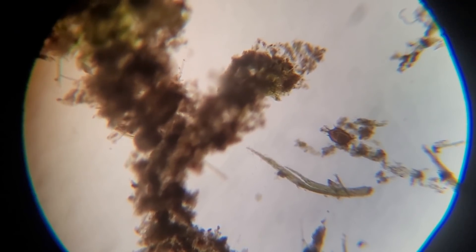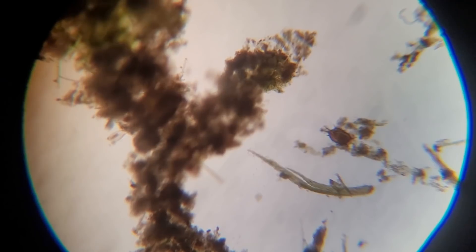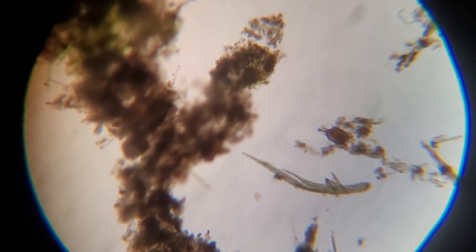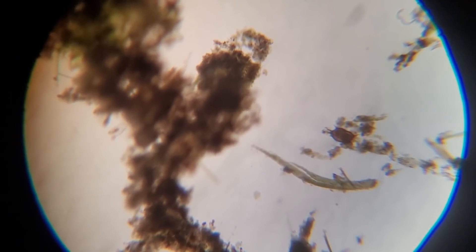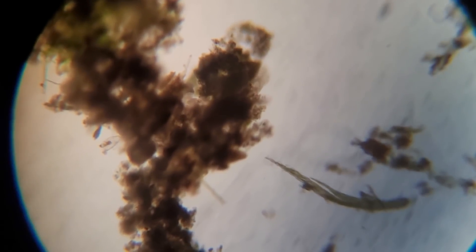Here's a good clump of material in this eyedropper — let's hold it still and see what life is present. It looks like we have one paramecium. We also have colonies of algae forming. There may be another little critter in there — like an amoeba, though it may be dead. And something is moving around that mass and eating it: maybe a stentor, maybe a tardigrade, or a little worm of some sort. So we do have some basic life, but mostly algae. It looks like we've got a little worm.